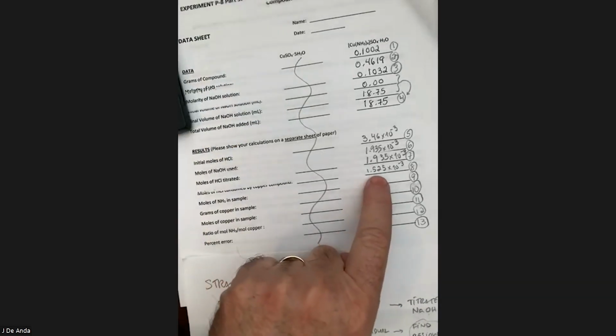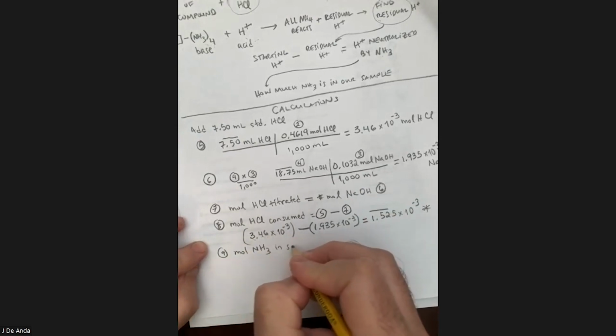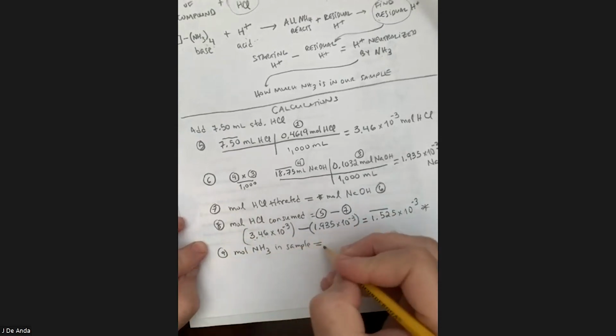Okay, everybody with me? So our next step now is to find out how many moles of NH3 were in the sample. Remember, the reaction between ammonia and HCl is also 1:1. So this is how much the ammonia in our compound titrated. Therefore, item number 9, the moles of ammonia in our sample, should be the same as the number of moles of HCl consumed, item 8. So we're going to say it's 1.525 times 10 to the minus 3 moles.